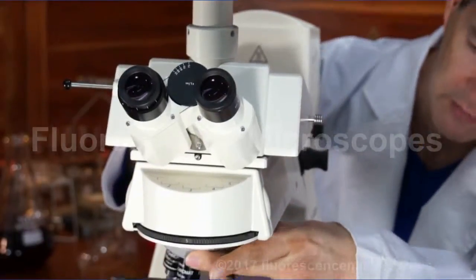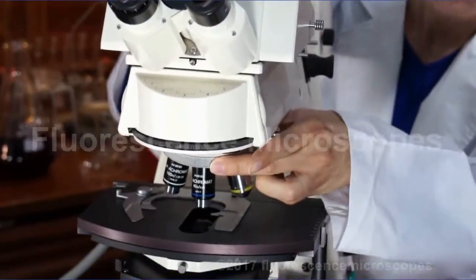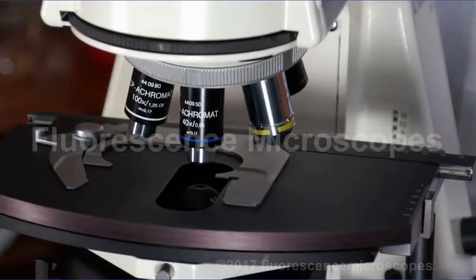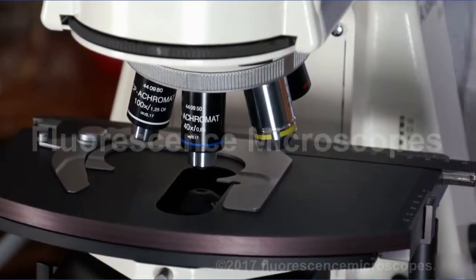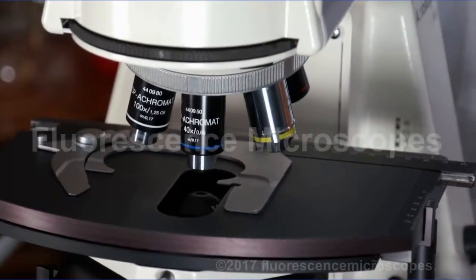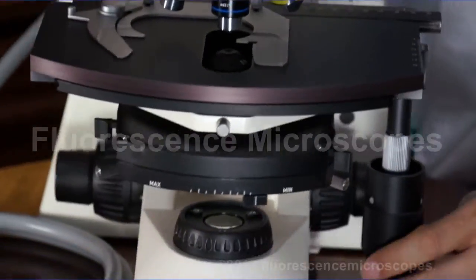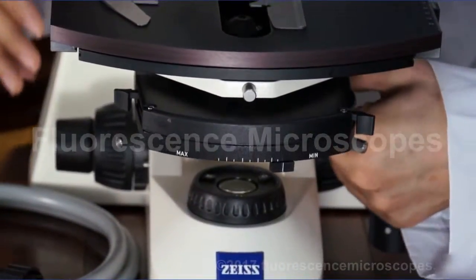We've configured it with several objective lenses. We can change these objective lenses however you may need. It's got a right-hand stage. And it's got a universal condenser.